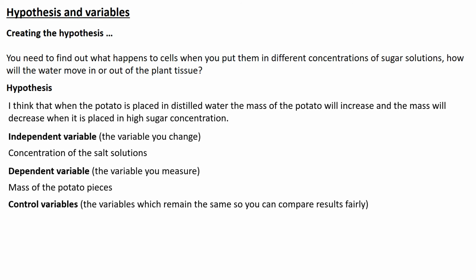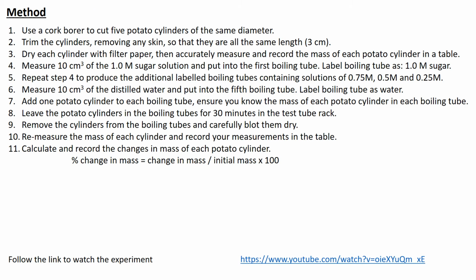Then control variables. So these have to remain the same throughout all of your repeats so that you can compare your results fairly. Be really careful, because they're going to want to know, do you understand why you're controlling this and why it's important? So the quantity of solution, the volume of solution that we use, and the time that is left in the solution.